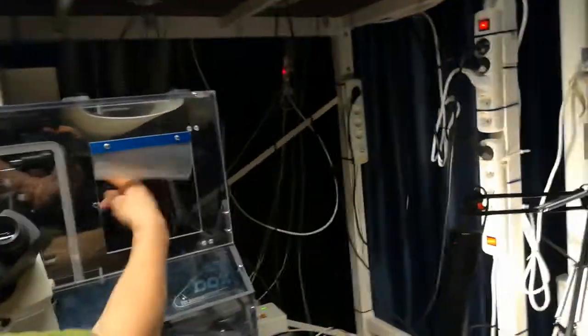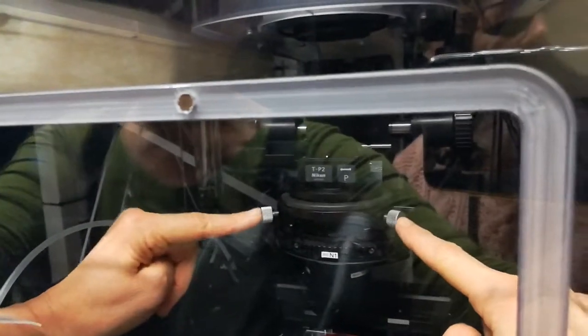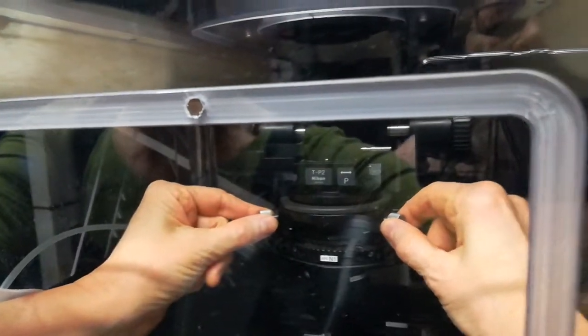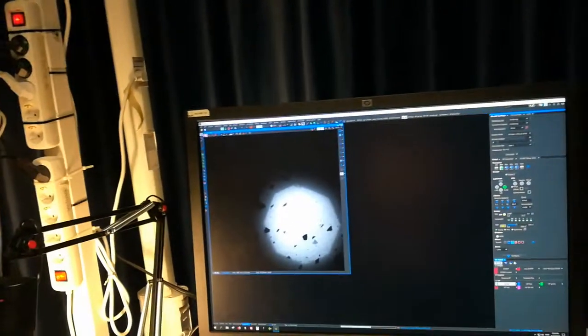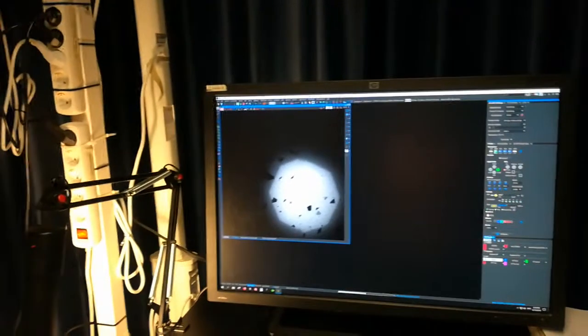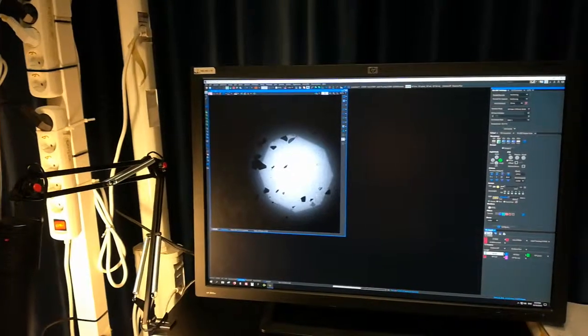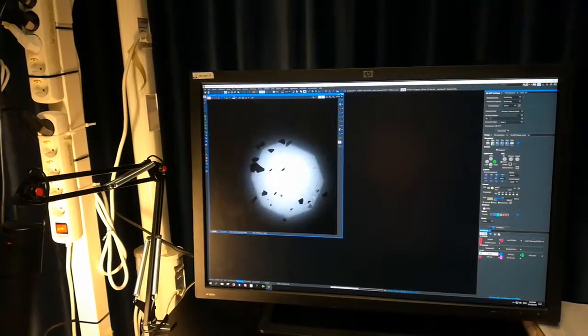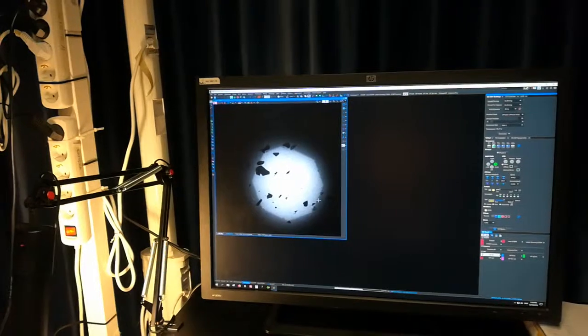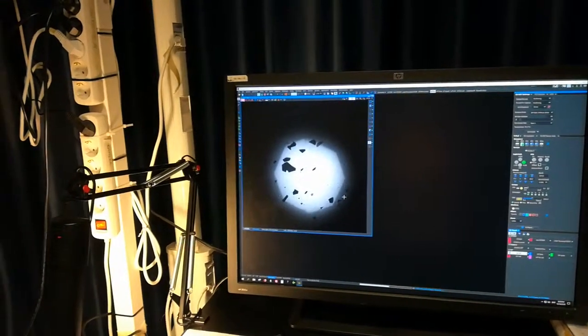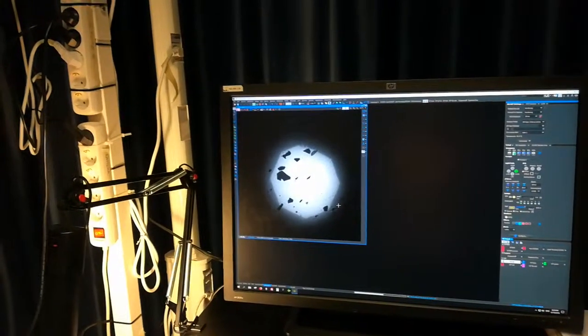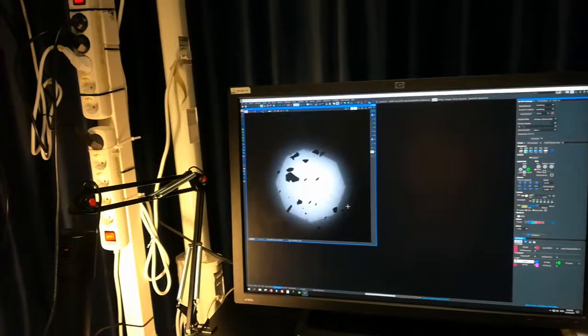Now we're going to use these two screws — on different microscopes they may look different, but it's always two screws at a 90-degree angle. I move them; I'm used to doing it in the eyepiece and not so much for the camera, so it's not super easy, but basically I am bringing that shadow by moving both of them together, bringing it more or less to the center.